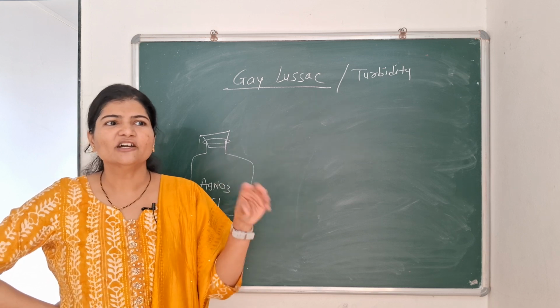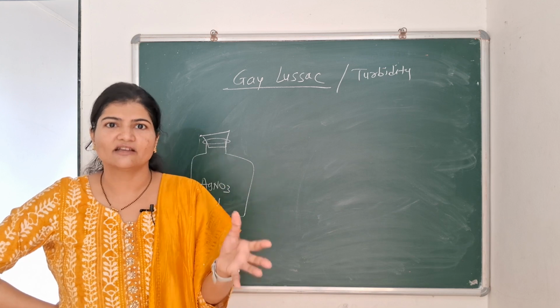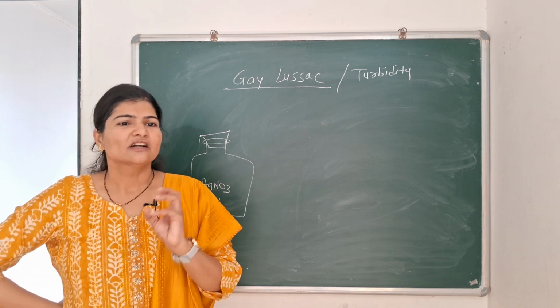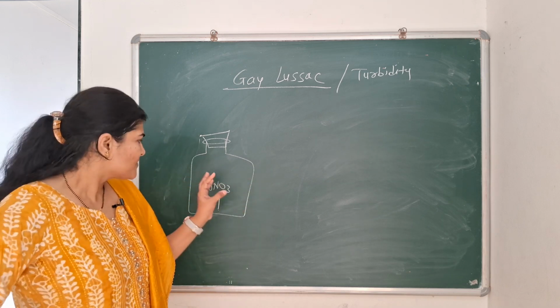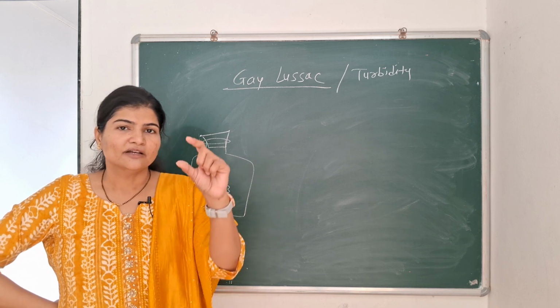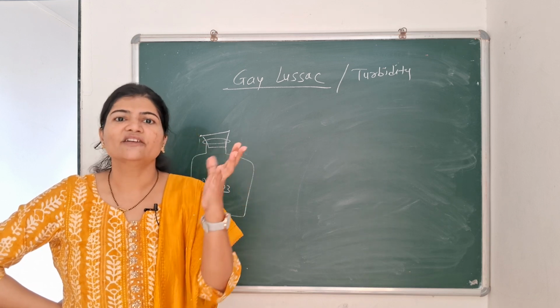So that will give me a tentative reading, because accuracy is at stake in this kind of titration. We are not saying that the method is very accurate. Actually this method is obsolete. Currently it is not in practice much, but it is a method we should know. So in the next cycle I will take another reading. Say the tentative reading is 100 ml.